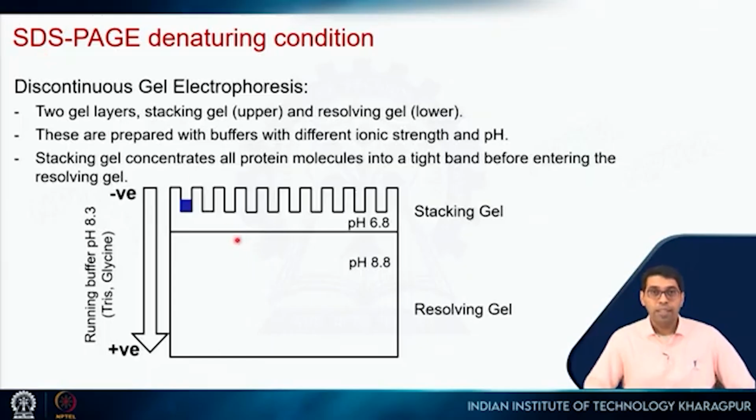Now, the setup will have two gels. It's not just one gel, there are two gels. This one is called a resolving gel. The actual separation happens here, and this one is called a stacking gel, right. I will explain what is the purpose of this stacking gel.